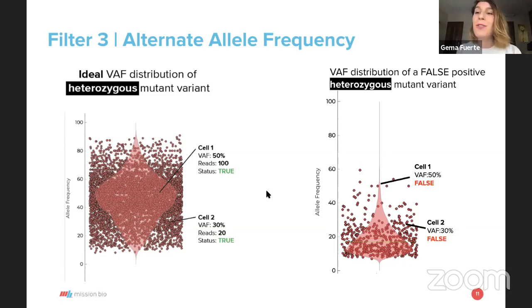So we cannot give you a minimum number of cells to call confidence. We would need to look at the distribution and see how well it looks. It doesn't matter if here we have 1,000 or 2,000 cells. This distribution is already telling us it is bad quality. So it is more the overall distribution of the variant allele frequency of the cells than the number that's important. That makes sense.